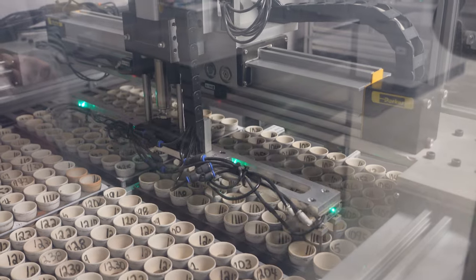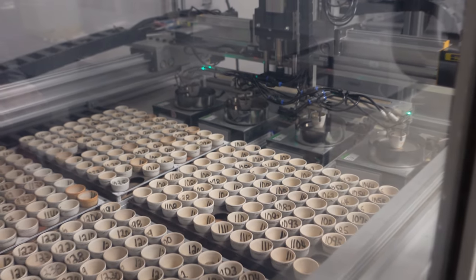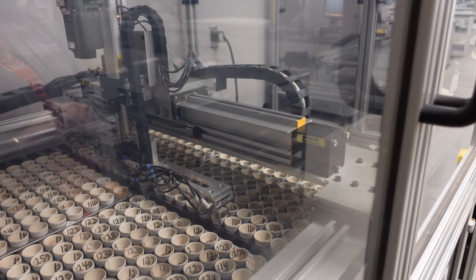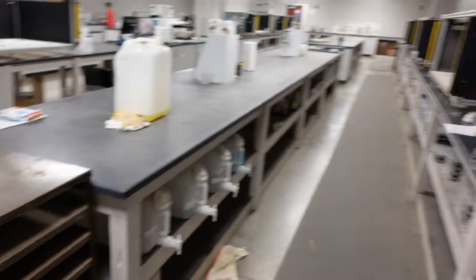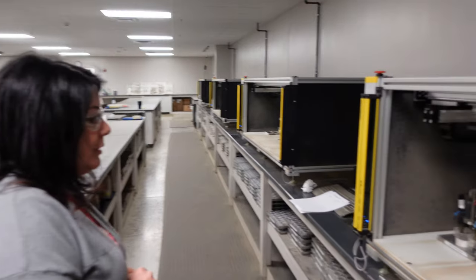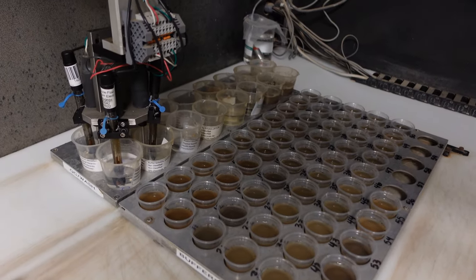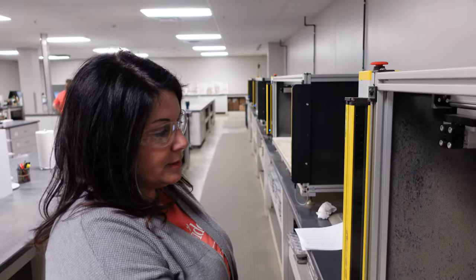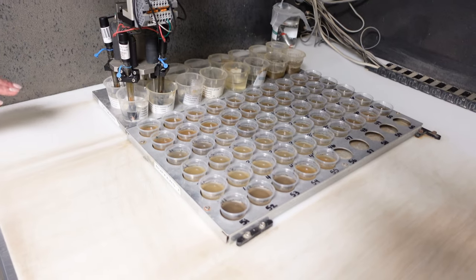There are quality control checks — the first five samples are a standard, and once we know our standards passed and all calibrations are in check, the robot is allowed to run its batch. We have a quality control sample every 50 samples, ensuring all checks and balances are in place. These are pH robots — we have four pH probes per head. These robots have to pass their calibration prior to running any samples in the morning, calibrating to standards of 4, 7, and 10.